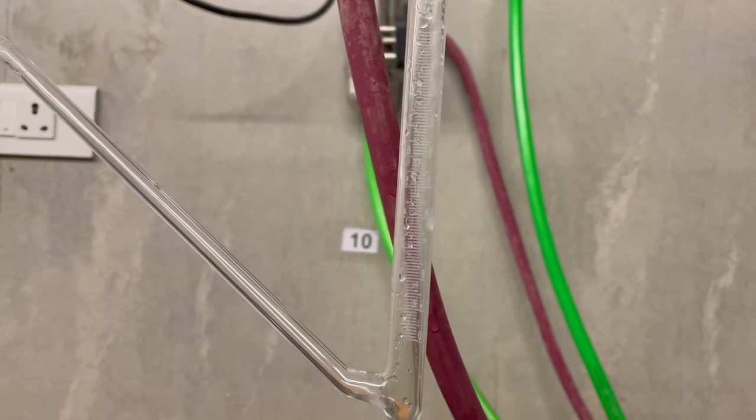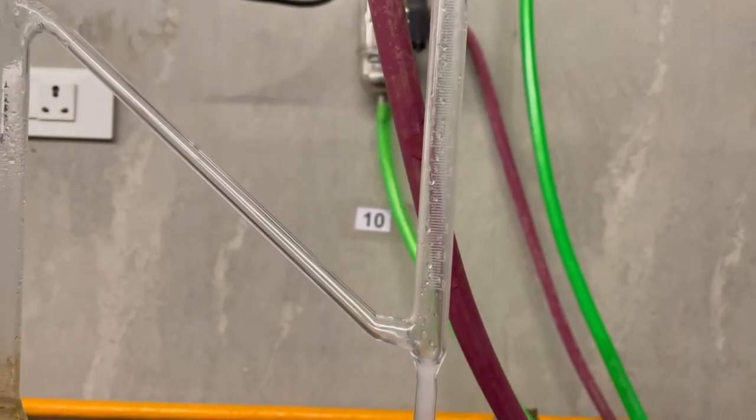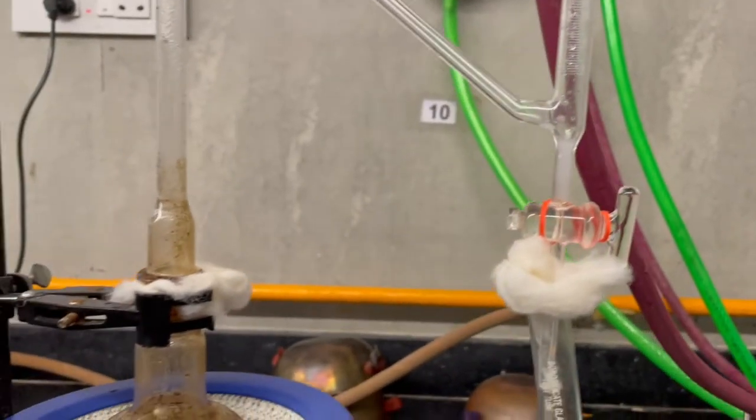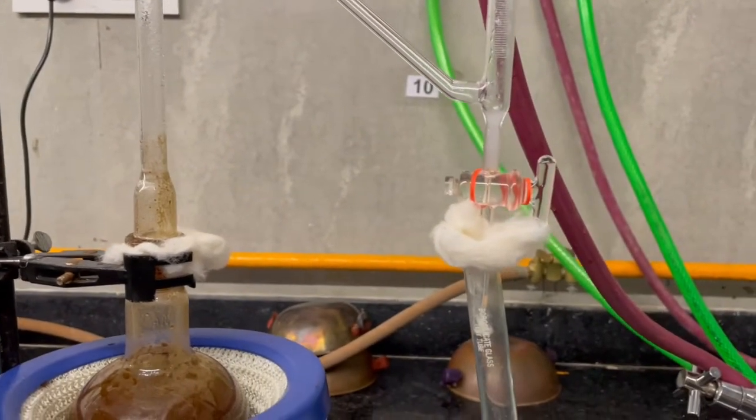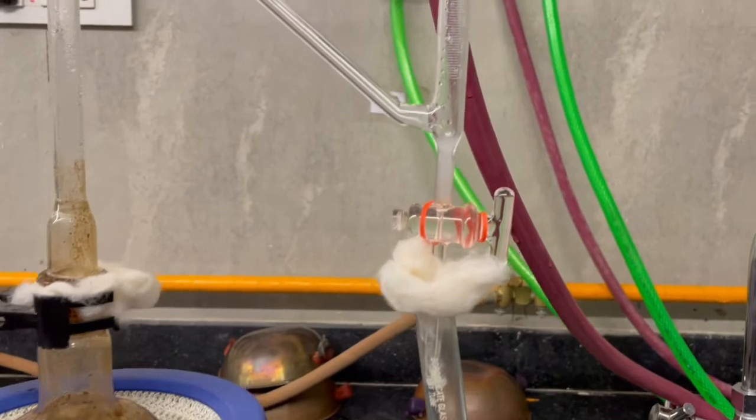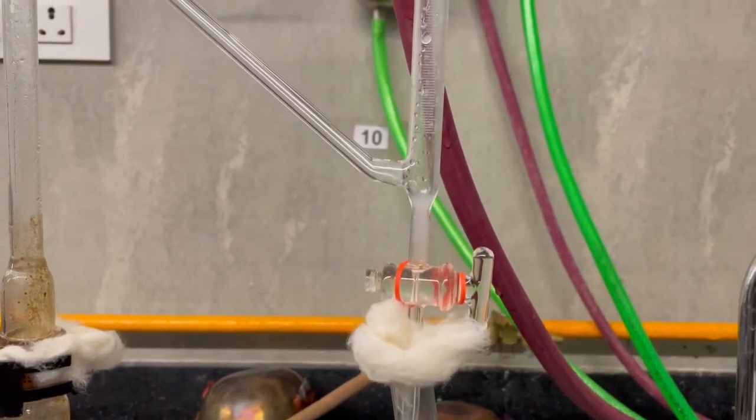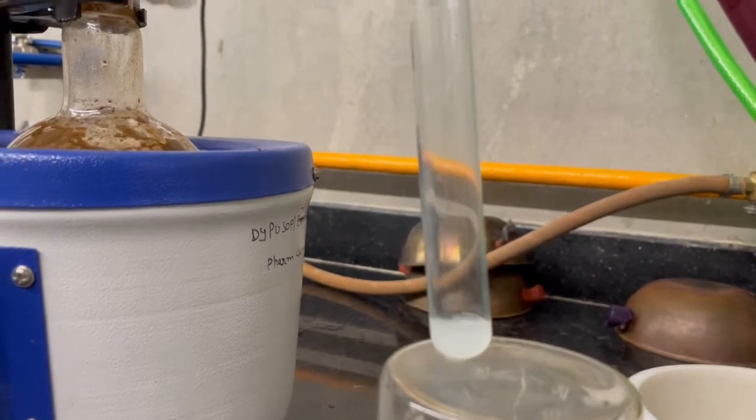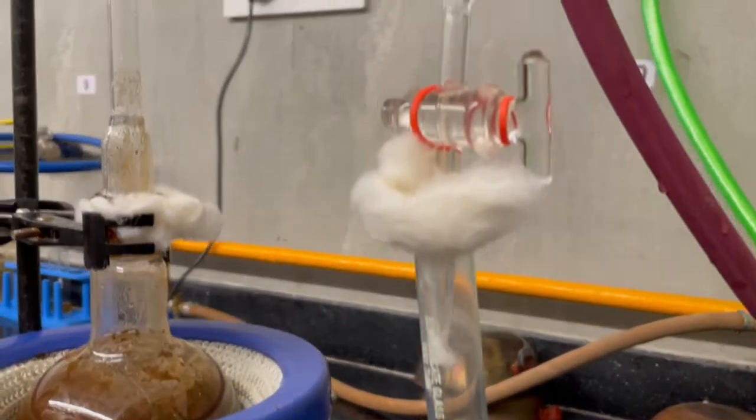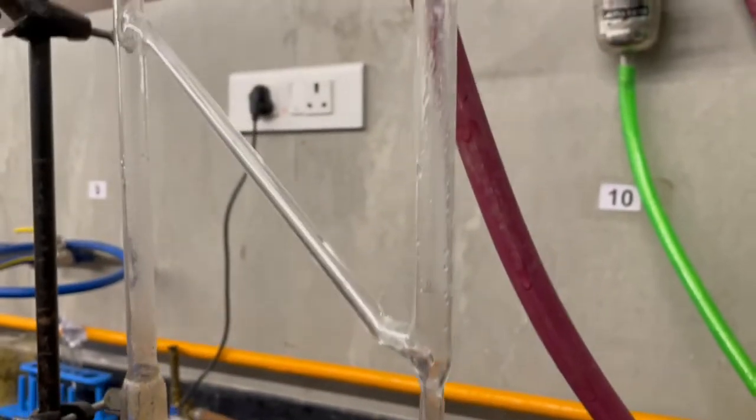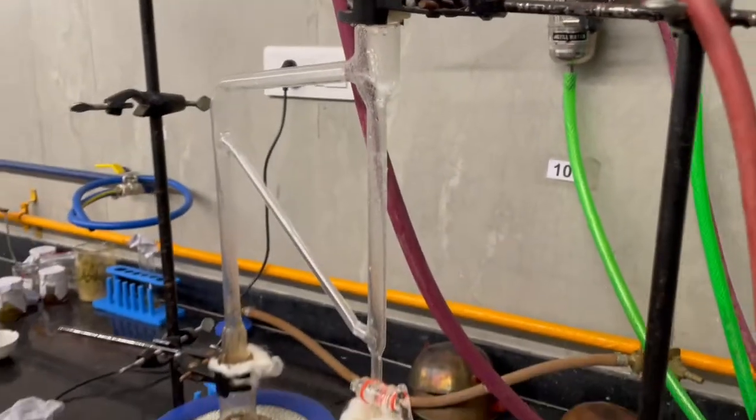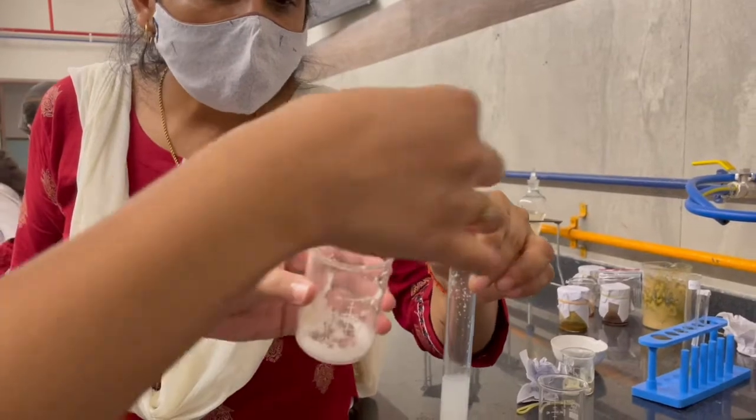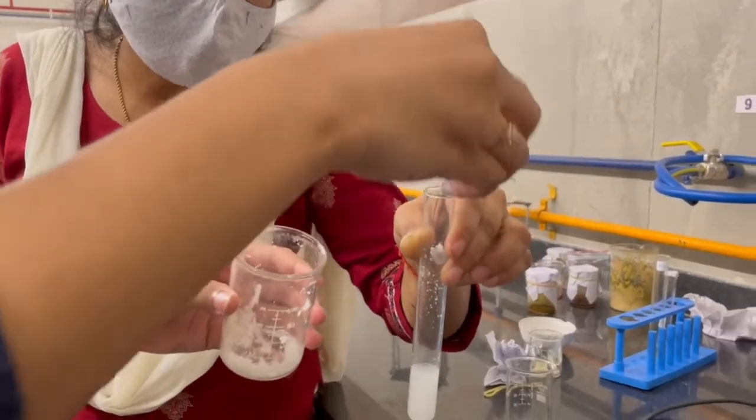Now we will have the condensed vapors of clove oil. Add sodium chloride in the filtrate.